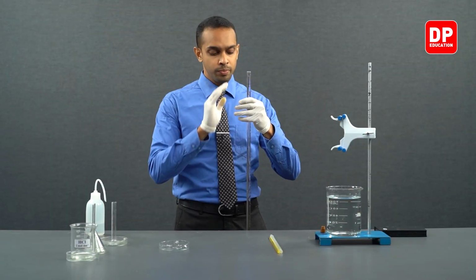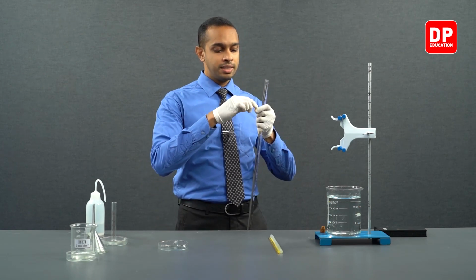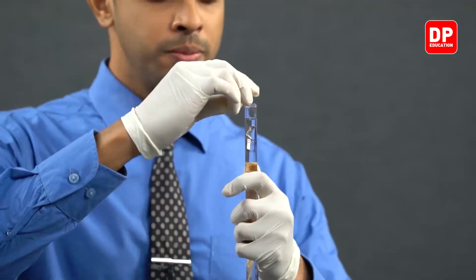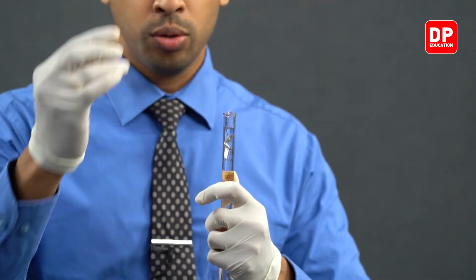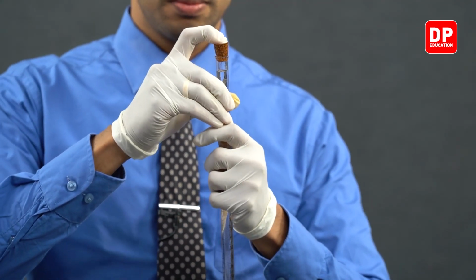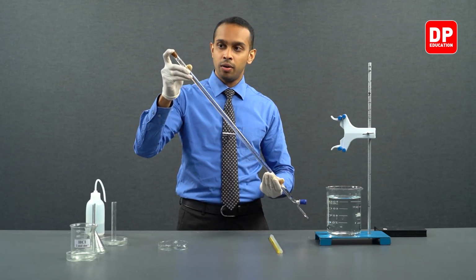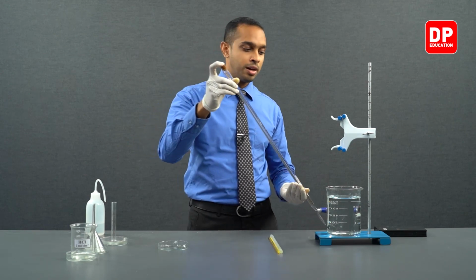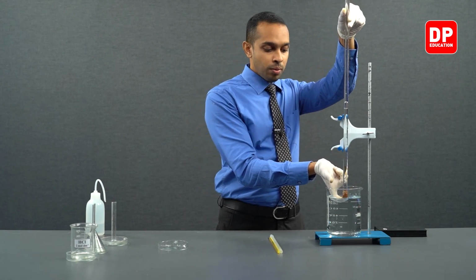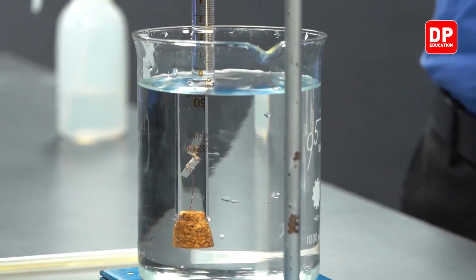Now we have added water all the way to the top. All that is left for us to do is adding this magnesium strip like so and securing it with our cork. After securing it with our cork, we will place our finger on top of the cork to ensure that no air or water will go out, and we will invert this burette and place it inside this 1 liter beaker.